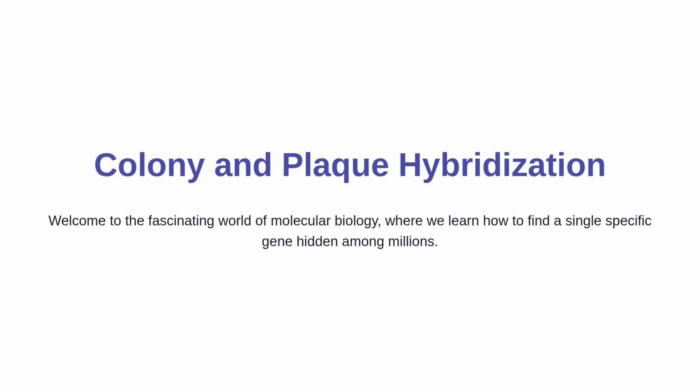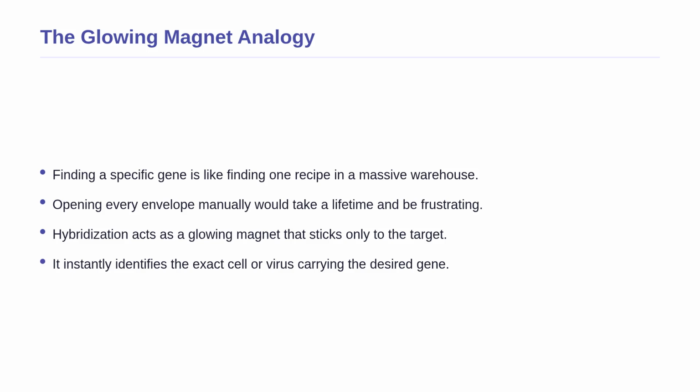It allows us to pinpoint the exact bacterial cell or virus carrying our gene of interest. Let us explore how this incredible molecular search engine actually works. Before we get into the technical details, let us build some intuition.